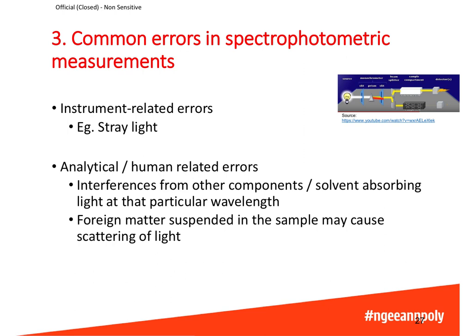that particular wavelength. So the result will not be accurate because the absorbance is not solely due to the analyte alone. If there is any solid matter that is suspended in the sample, for example, some dust or some excipients that are not soluble, that may also cause scattering of light, which would affect the absorbance.